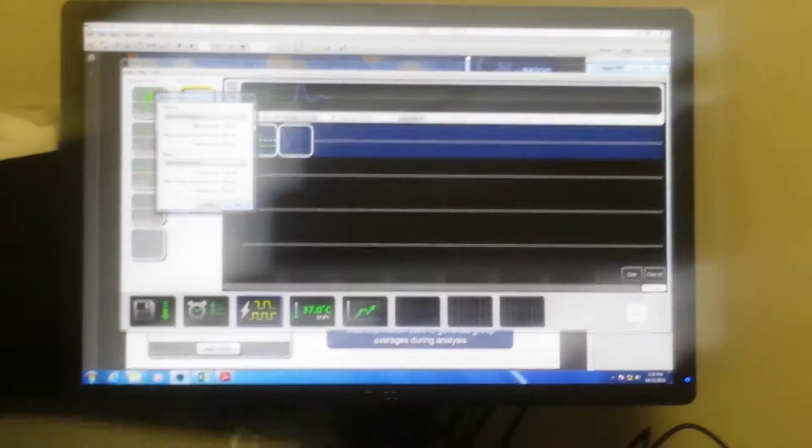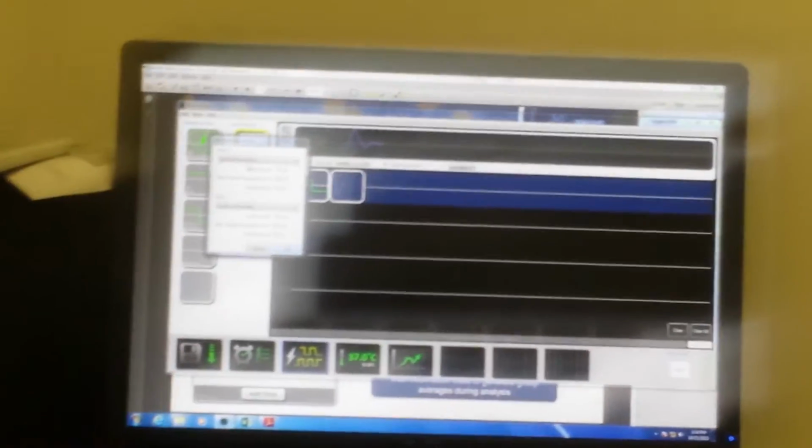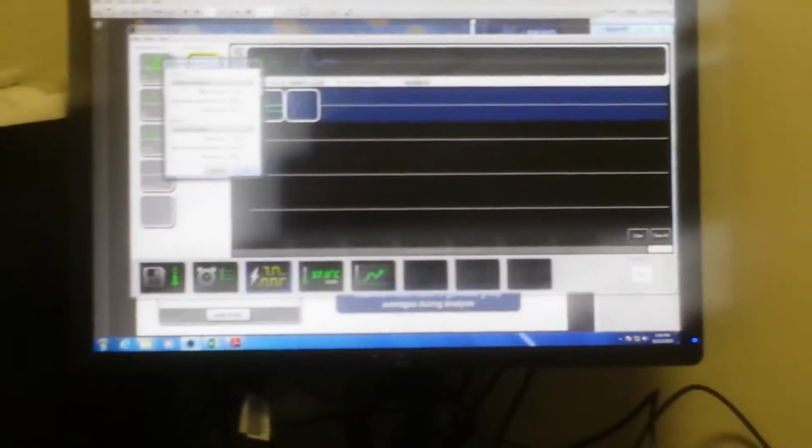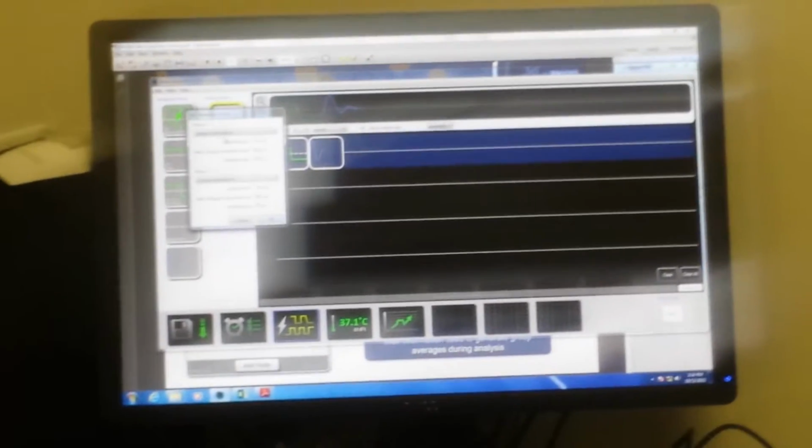Actually, this is a good time to point out. If you go to the stimulation section, which I believe they changed the page on me since 2.1 came out, we've actually got a note for a publication on just stimulating neuronal cultures, where it talks about waveform size, durations, all those good properties. So I'd recommend checking that publication out. It's a little bit of a play with each culture you put on. You've got to find the electrode the neurons are on in order to shock them there.